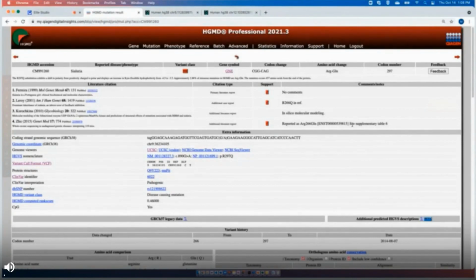And it also shows the value in having someone manually look at the information, as they're not just reviewing the body of the text, they're able to look at graphs and figures. They look at supplemental tables, supplemental information, and then they point you to where they found that key piece of information for the variant.